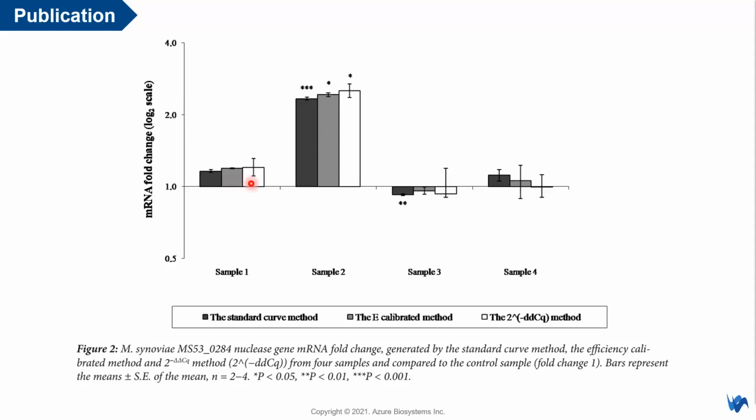The differences of expressions calculated are not very much different when you have high expression changes as compared to control. But when you have low expression changes or differences, these three methods will start to show some pros and cons.